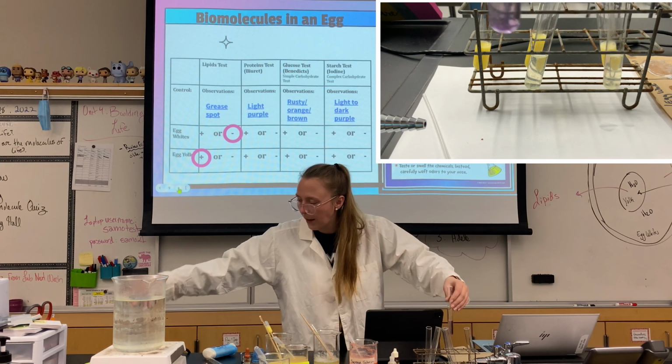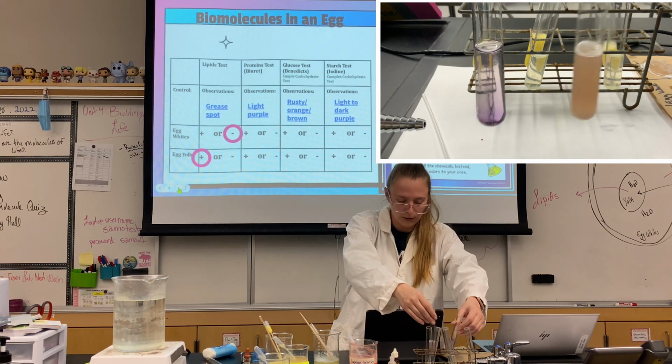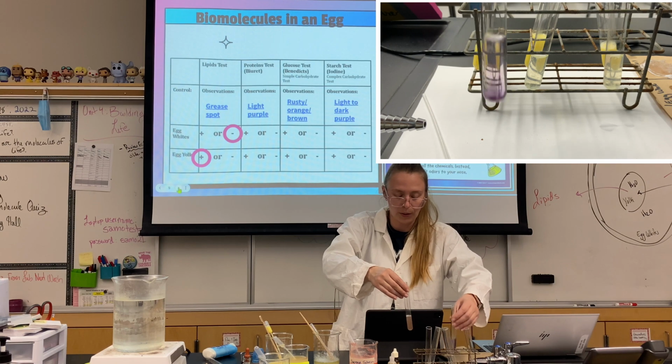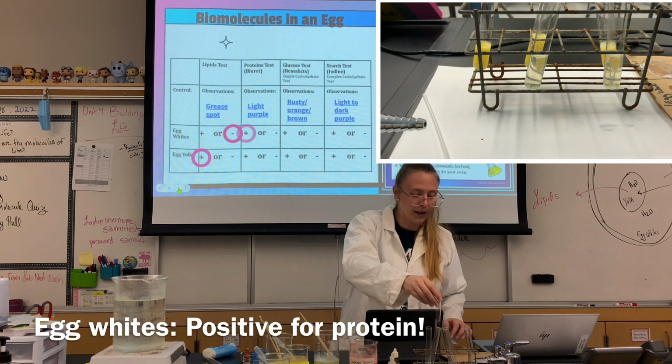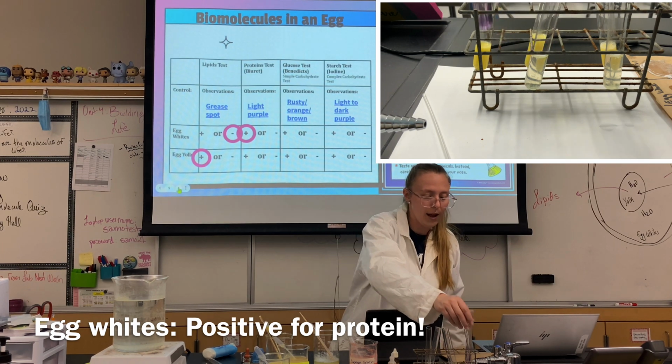Remember, we're looking for a light purple. So like how this turned purple, this definitely turned purple. So that means that we definitely have a positive reaction for protein in our egg whites.